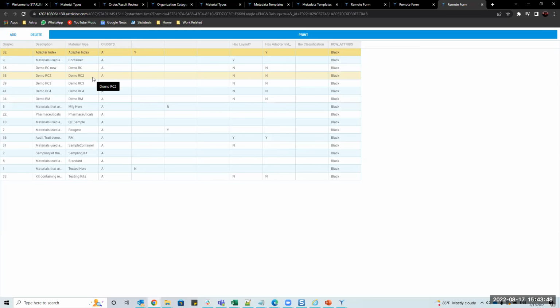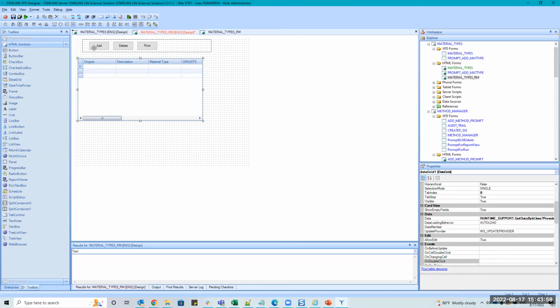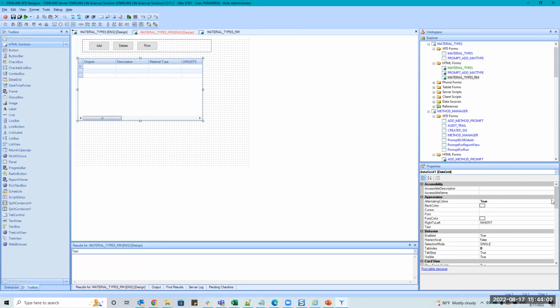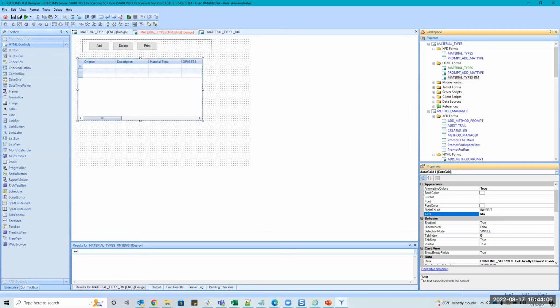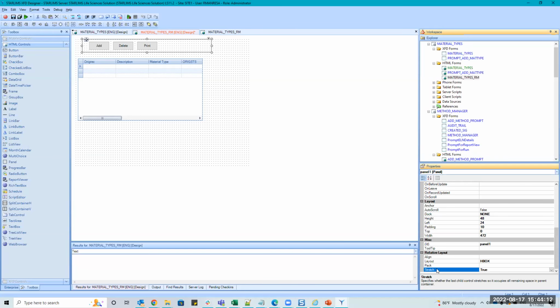And this is like second nature for me, right? I go in, I do the stretching, the padding. I usually do 3, and then I do a padding on the form itself to give some space between this control and this control. On the grids themselves, I include this text property. You don't see it anywhere, but you see it in design. On this, I don't do the stretch, but I do slightly less padding.